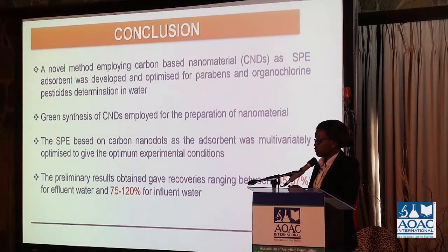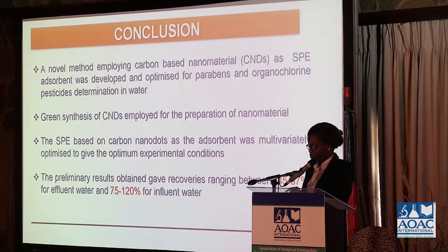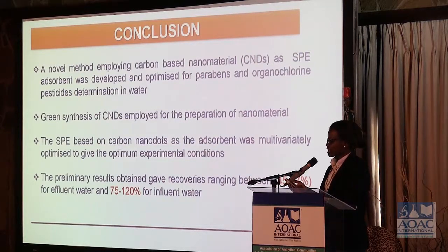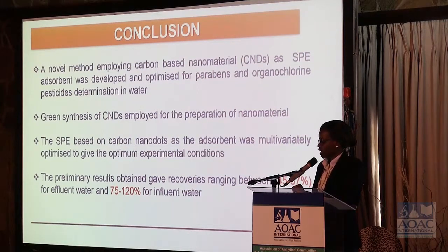In conclusion, in this experiment we developed a novel method based on carbon-based nanomaterials as an SPE sorbent for the development and optimization of parabens and organochlorine, organophosphorus pesticides for determination in wastewater. Green synthesis of carbon nanodots was employed for the preparation of this nanomaterial, and the SPE based on carbon nanodots was optimized multivariately to give the optimum experimental conditions.